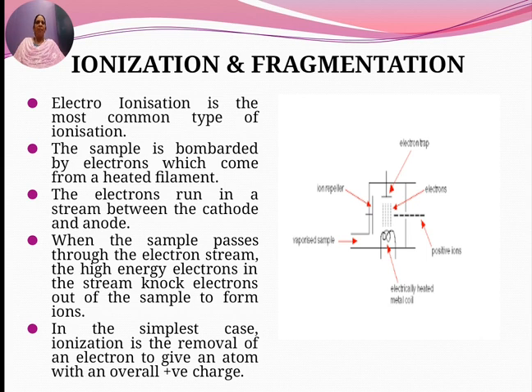The sample is a vaporized sample. It is bombarded with electrons which come from an electrically heated filament, a heated metal coil. The filament emits electrons, and the electrons run in a stream between the cathode and the anode.